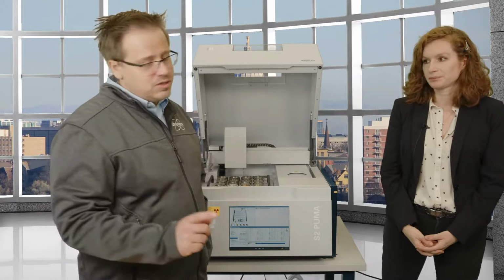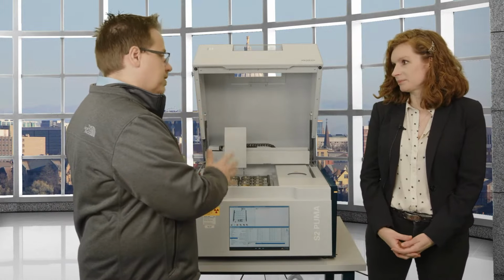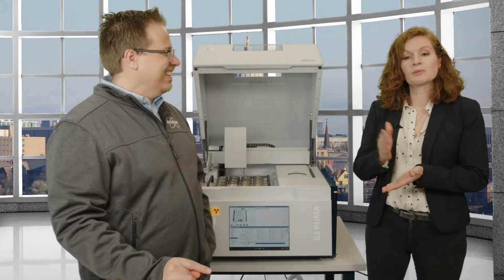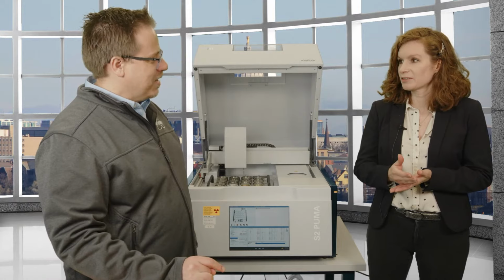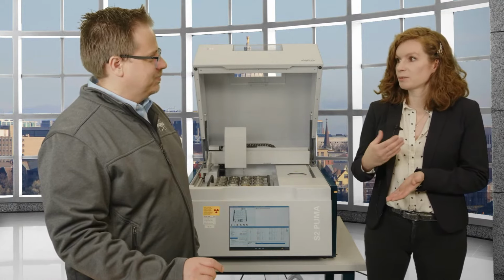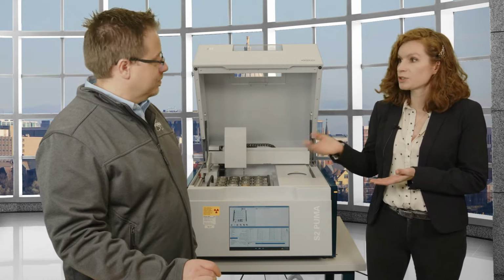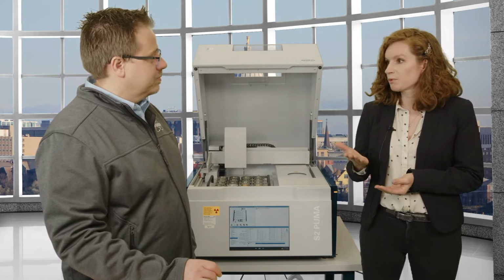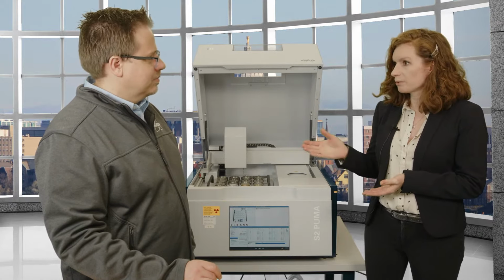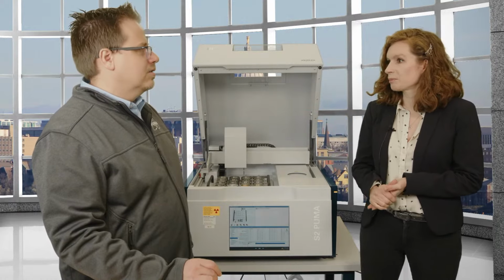All right, so Doug wanted to know, what about the precision? What's the precision of something like this? It also depends on what you're measuring, right? In general, it comes down to how much intensity do you get out. Metals fluoresce a lot, so getting high precision on them, getting ppm level, or sometimes even a little bit below, is achievable. Whereas if you look at sodium or fluorine, trying to get to 1 ppm, you just won't be able to do that, or you have to measure super, super long, and that might kind of crisp your sample a little bit.